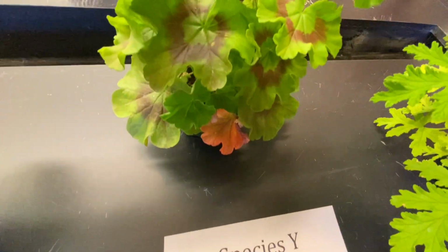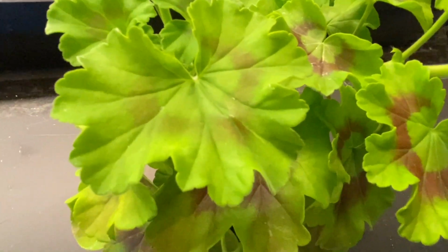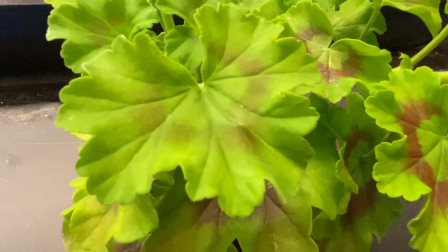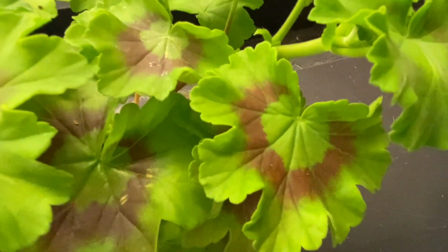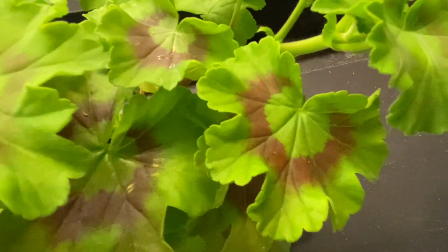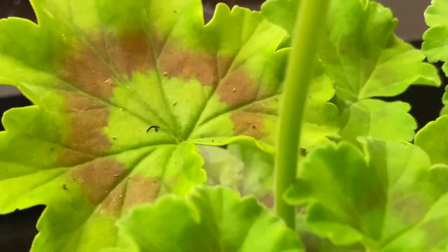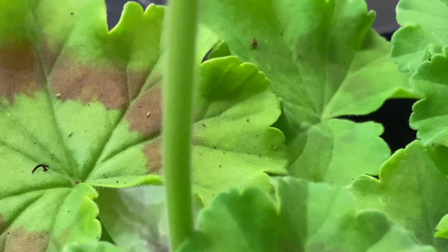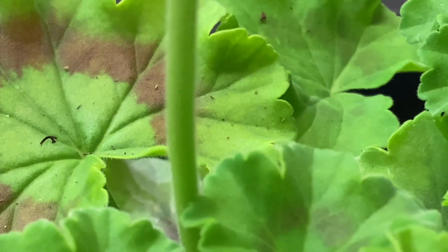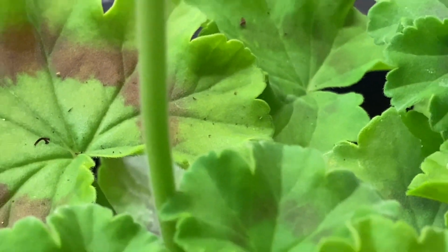Species Y has that broad leaf once again, somewhat soft, rounded borders, but look at each of the leaves. Each leaf seems to have a red or a purplish ring around the center of it. To be fair, once again, let's look at the stem. Sorry about the box in the background there. A little bit fuzzy, but not as much as Botanicurus, I'm sorry.